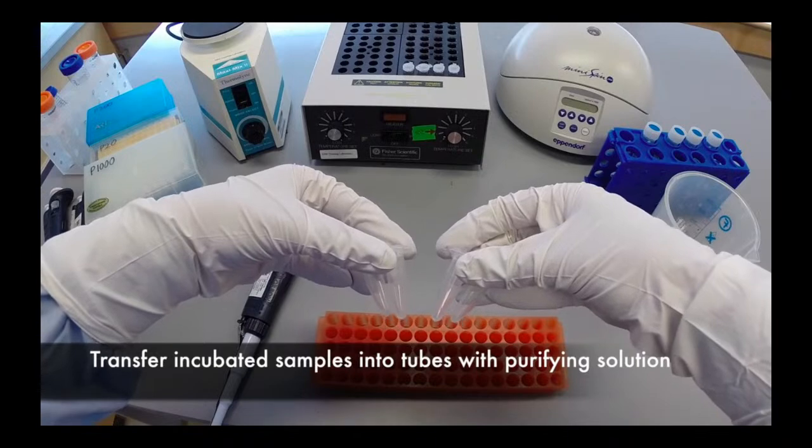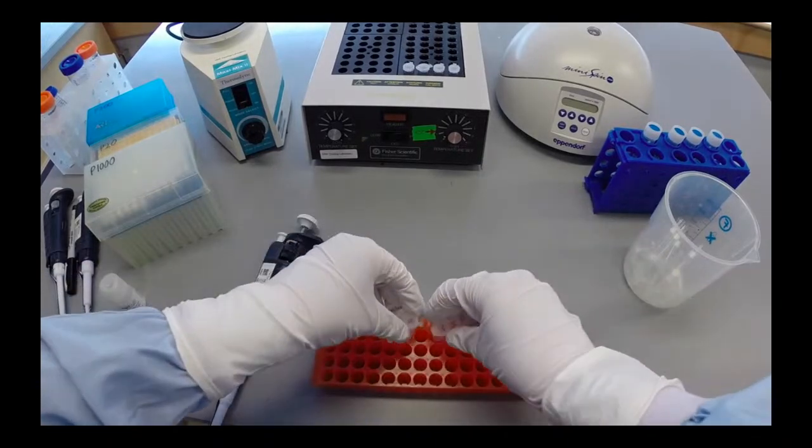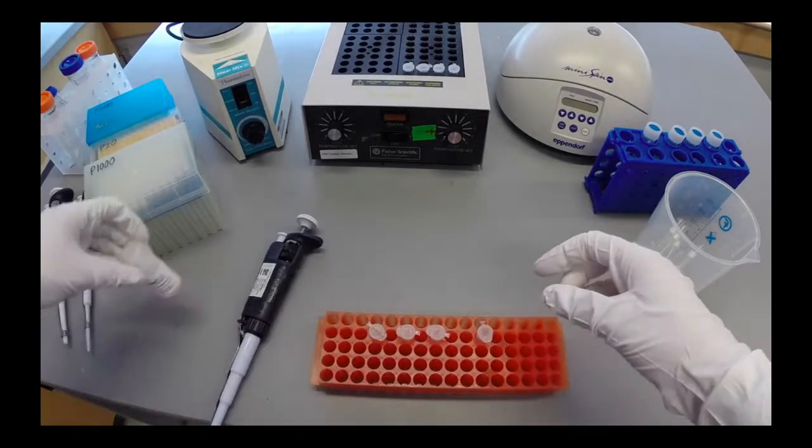Tubes containing 20 microliters of DNA Genotech's proprietary purifying solution, Prep It, will be provided.